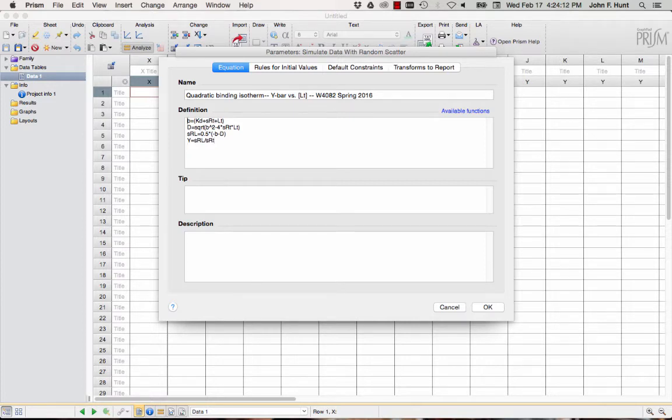So this shows one of the powerful capabilities of PRISM, which is that I can put in sub-equations, and PRISM will know how to combine these internally. And so that means I can avoid writing very, very complicated equations with lots of variables all strung together. Now, in the equations we're going to give you to actually solve problems, I think most of them are set up as sort of a single equation with lots of variables. There are some advantages to doing that for some applications.